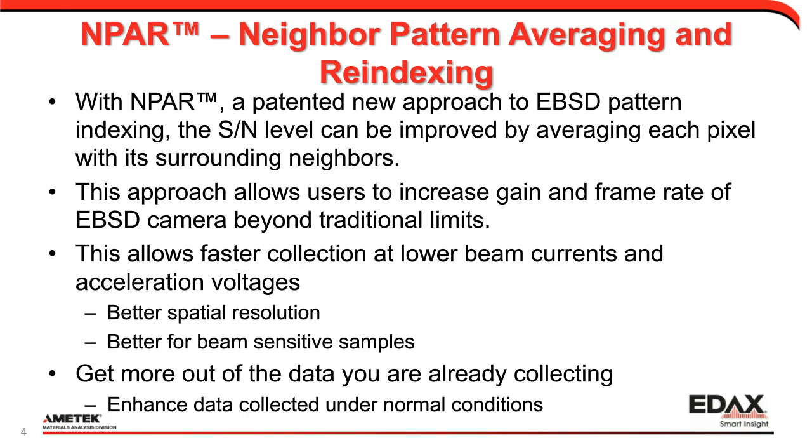In the past, I'd just say, okay, I need to go slower so I get more signal. I had to do frame averaging. And all of that slows down my data collection process. With NPAR, I collect my data, and rerun it later. Something I should mention now is that NPAR is a reprocessing step. It is not currently done live. We only do it after the data has already been collected.